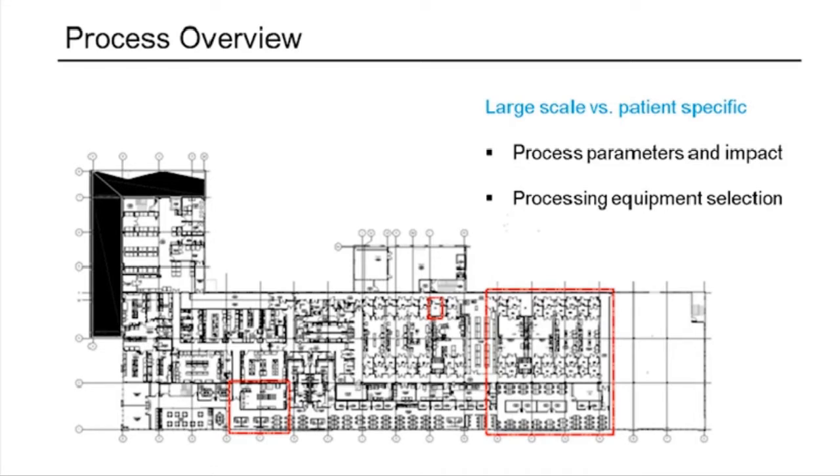For example, if you are cryopreserving your cells and you're introducing DMSO as a cryopreservant, a lot of times there is a maximum amount of time before those cells have to be put into freeze to keep them from degrading too far. And so if you are doing a lot size of 1 liter or 2 liters, processing that through formulation and filling and putting into freeze has a dramatically different kind of time criticality than if you are trying to do that for a 1,000-liter bulk.